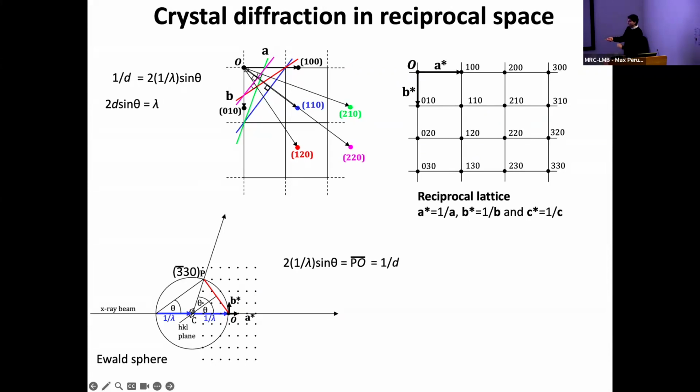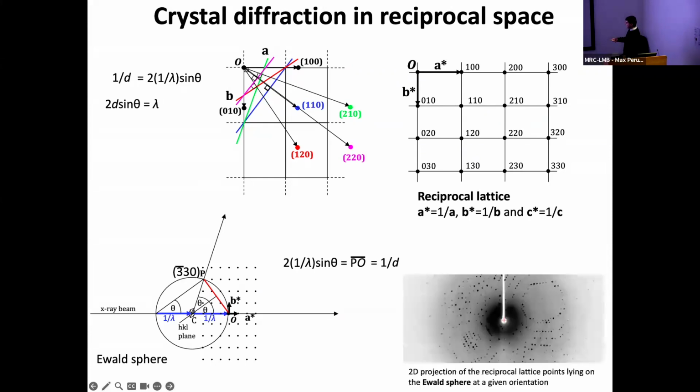So now we can imagine that all these rays coming from this sphere, when you project them onto a 2D surface like the detector, start to look like these circles, which are called lunes, the Latin word for moons, because they're like half moons.